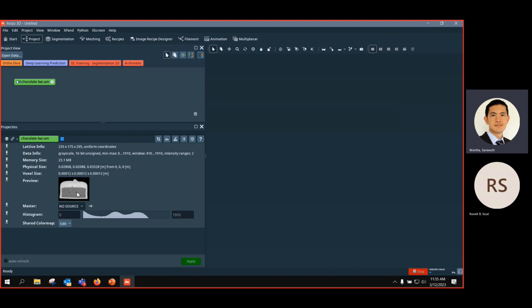You can see quickly it's chocolate with 3 phases: background, bright chocolate, and the filling. You can see the histogram and the dynamic range of the histogram of the grayscale. They have 3 peaks. Most of the intensity distribution is in the very background, the black one, then the middle, medium gray, and the third one is more like the brighter intensity.